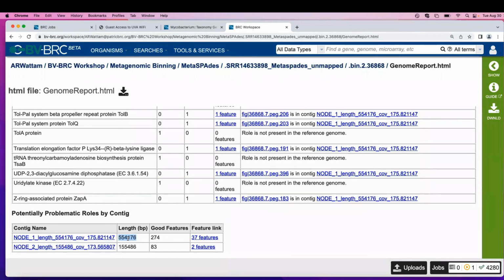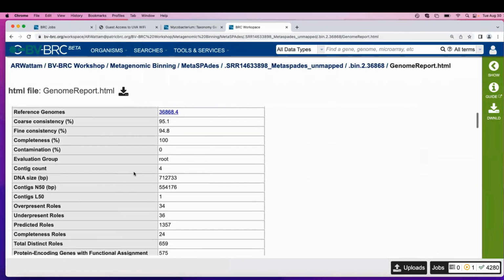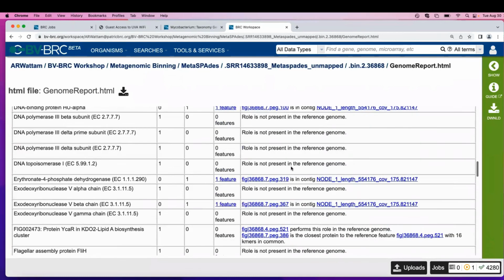Although this is an endosymbiont. Well, how big is this guy? When I saw that, I would be thinking, ooh, maybe lateral transfer. Yeah, but that's probably the biggest contig, so that's why. Yeah, I would be thinking, because it's an island in there.